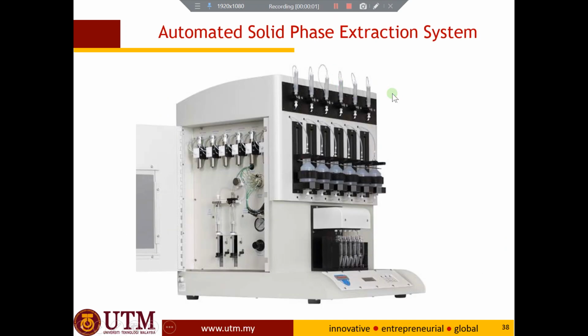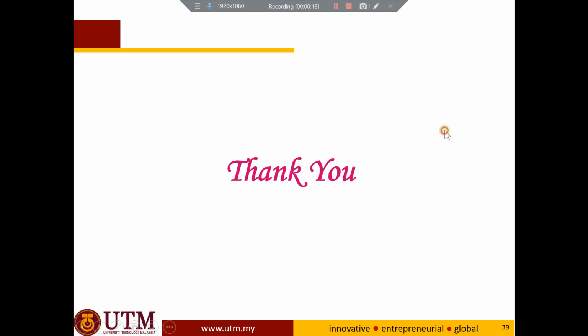here is the automated solid phase extraction system. I don't have any experience with this. I'm not really sure if we have this in UTM, but the one in the video in the earlier slide, we have that, and I have that chamber.